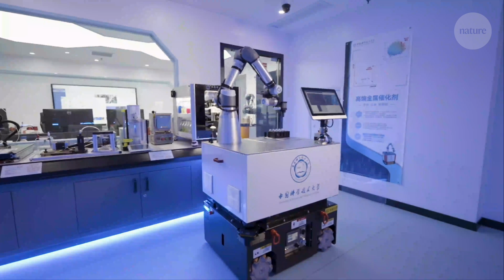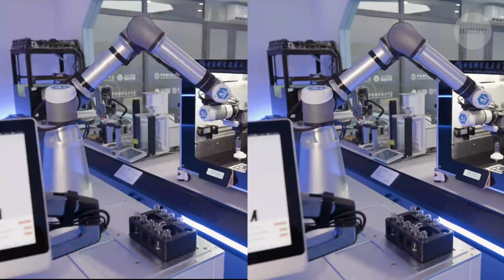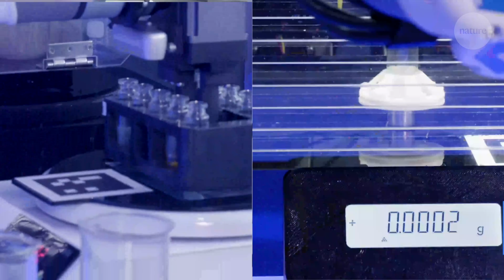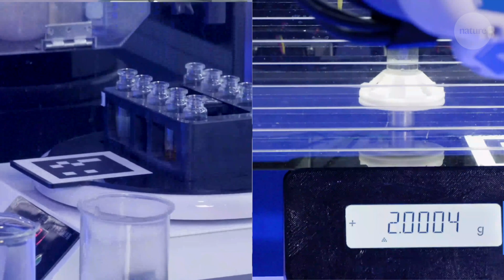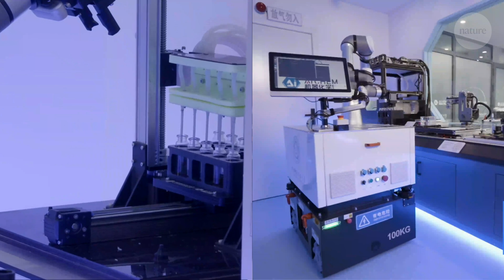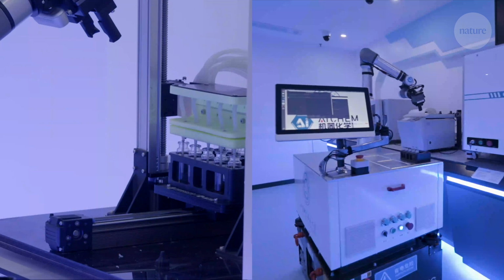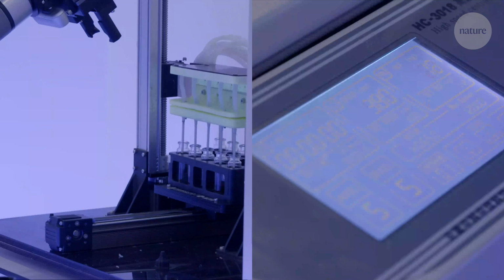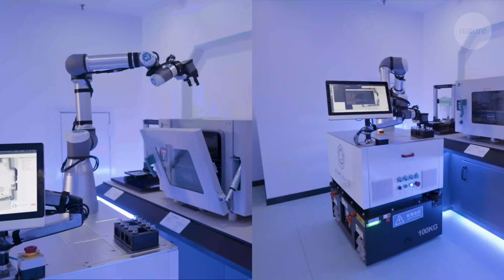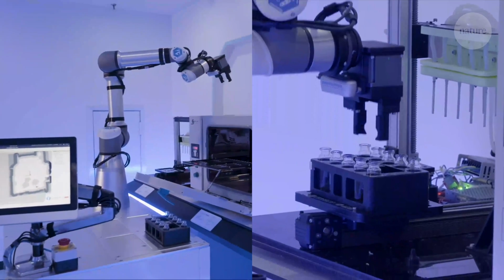First, it collects material, say a rock or an ore from the surface. Then it breaks it down using simple acids and alkalis, and analyzes the resulting compounds. This is where the AI comes in. By comparing the products with a huge database of millions of chemical formulae, it's able to start synthesizing and optimizing catalysts capable of breaking down water. The team behind this research say this kind of process could take a human chemist thousands of years.